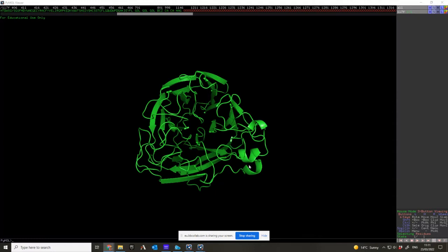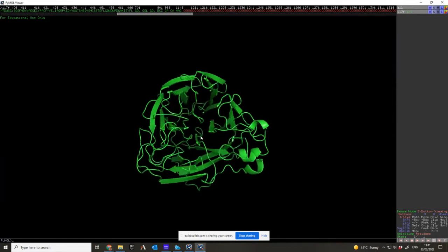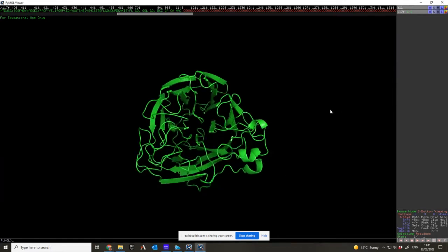What's special about this one is these helices. These are not present in the bat version. So when I overlap them, they're not there. Looking at it like this, it's not very easy to understand. So it's better to do some colouring.